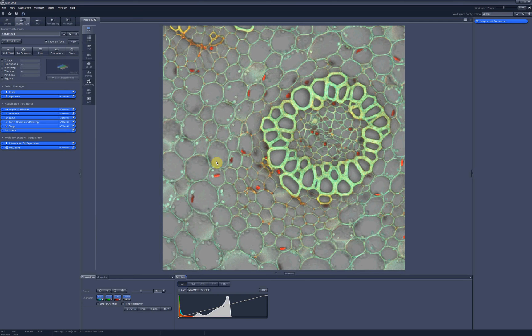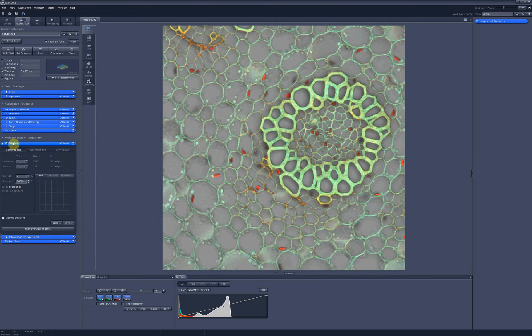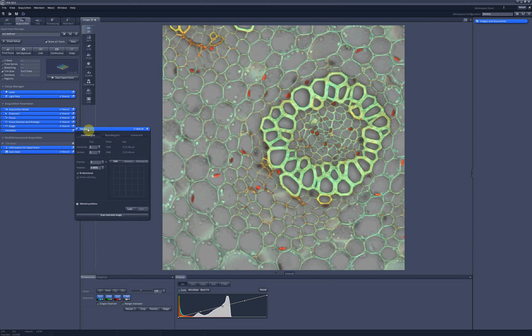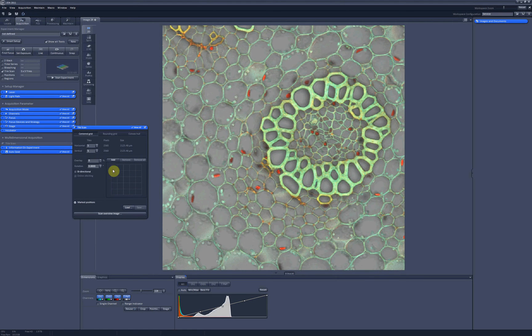When you want to scan your sample using high magnification lens and your sample is too big to fit into your acquisition area, you should use the function called TileScan, which is available right here and shows up right here. The TileScan option allows you to scan your sample tile by tile, and then it will put all the tiles together into a bigger image.